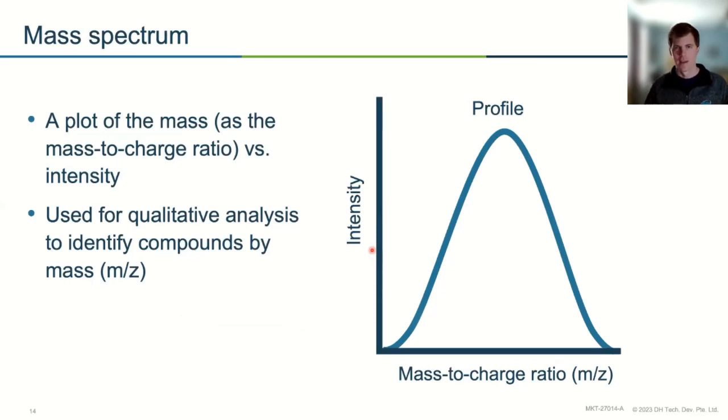Well, technically, every time you create a mass spectrum, it's somewhat quantitative. It kind of depends on how you got there and the degree of usefulness of this intensity, but you do have a mass versus intensity. Your instrument is saying at that moment in time, this much of this thing hit the detector.